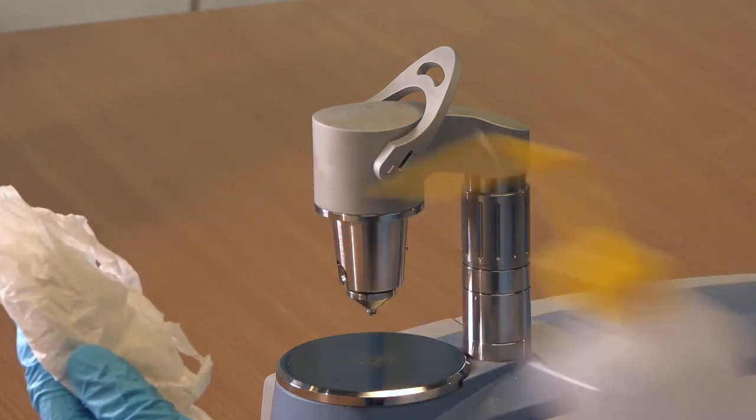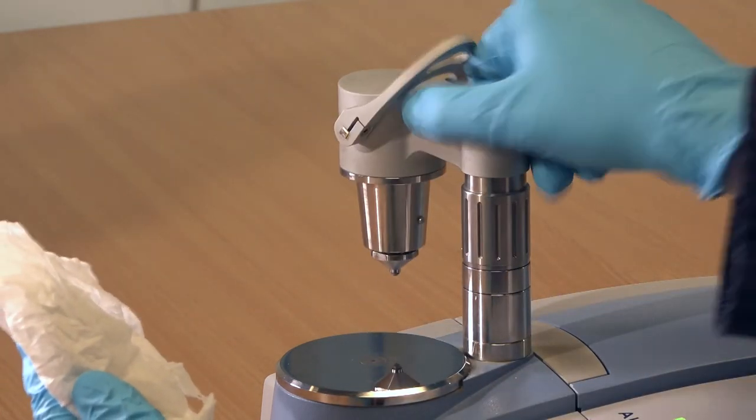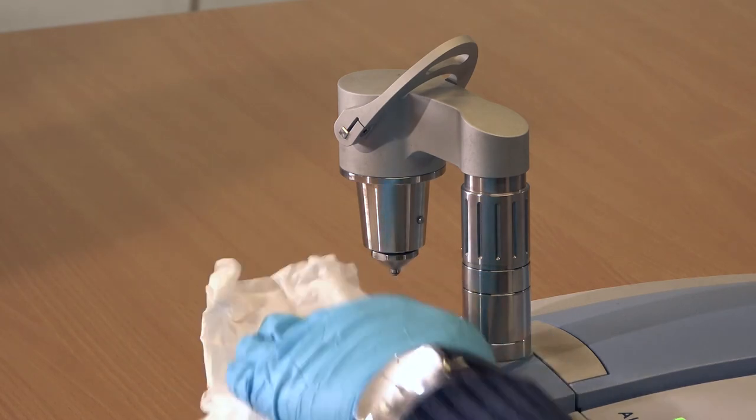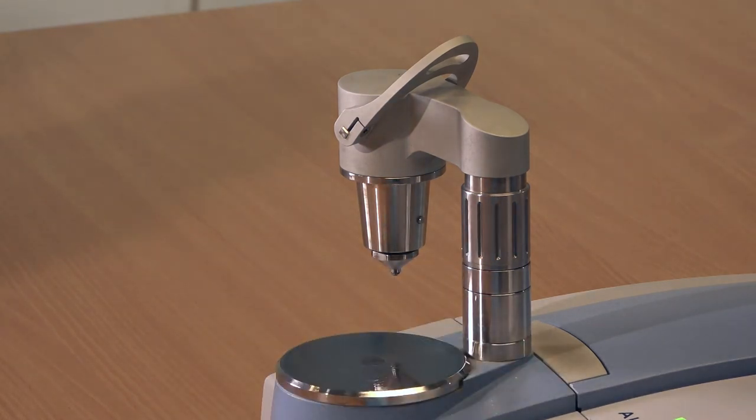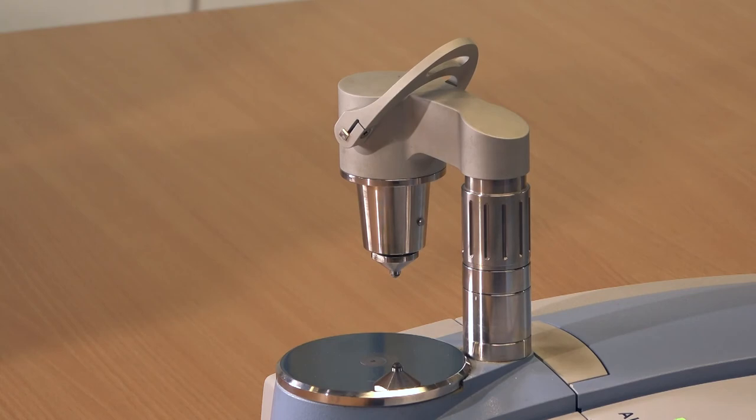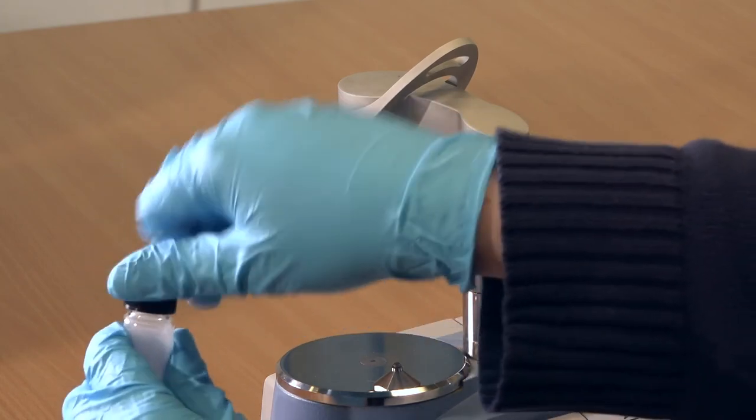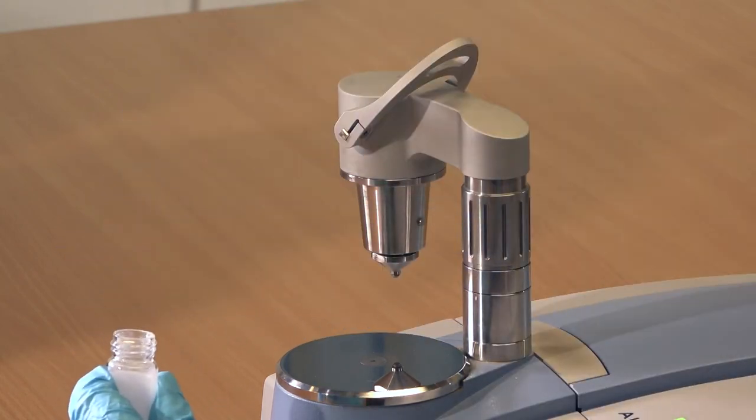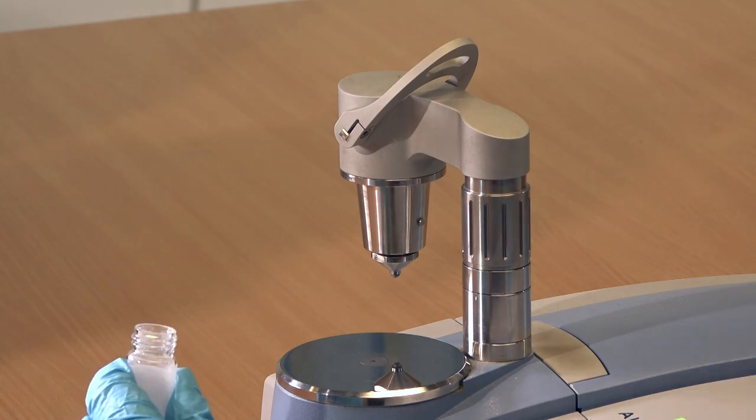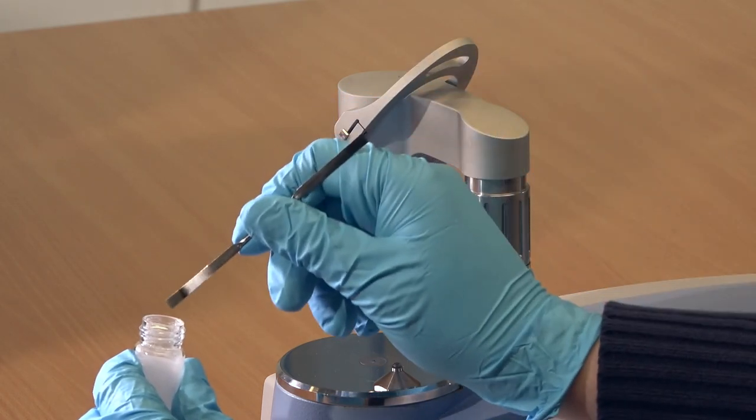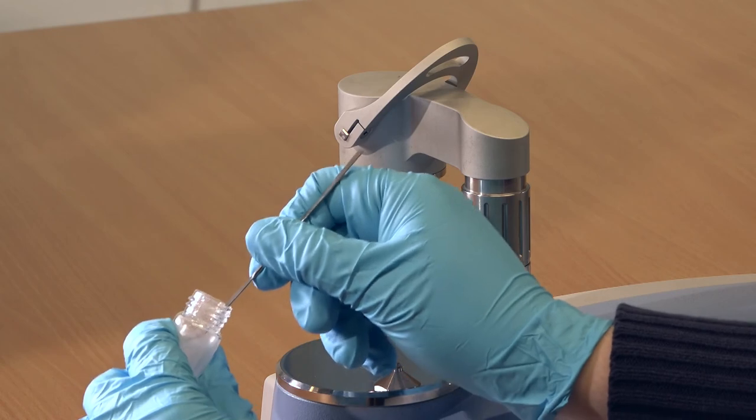This should be done between every sample measurement and is important to ensure no cross-contamination happens between samples. Making sure the arm is out of the way, take a small amount of solid from the sample vials provided using a micro spatula. A micro spatula tip's worth is enough to ensure the square central window is covered as shown.